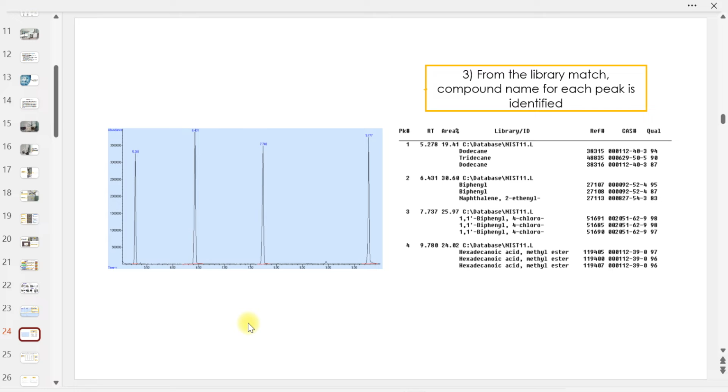Selalunya saya tak buat 3, saya buat lebih. 5 atau 7. Lepas tu baru you pilih yang mana yang paling banyak. Tiga tu akan jadi ada isu juga. Replication tu, you memang kena buat banyak, tak boleh buat sikit. Tujuh atau lima. Yang paling tinggi, yes.